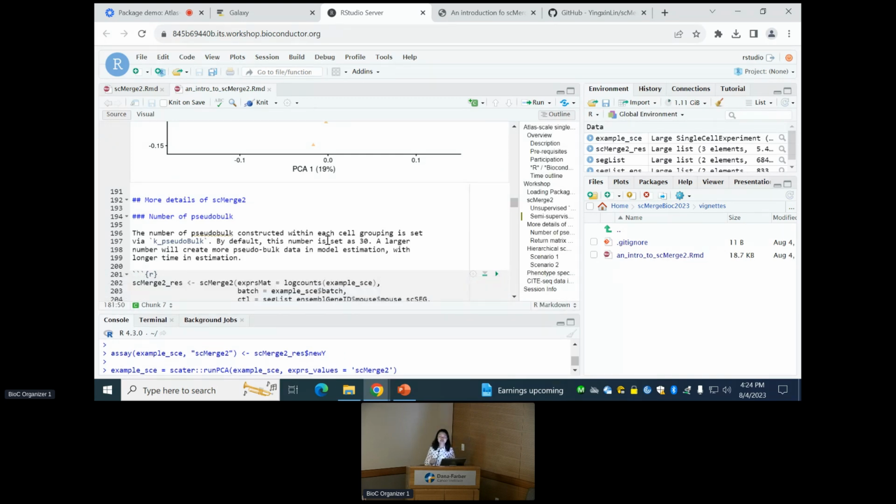Maybe I'm missing something, but is there not a circularity, in the sense that you find a common embedding, then cluster and label cells, and the clusters found before integrating and the clusters found afterwards supposedly influence each other? Yeah, this is a very good question. I think it depends on what questions you want to answer for your analysis.